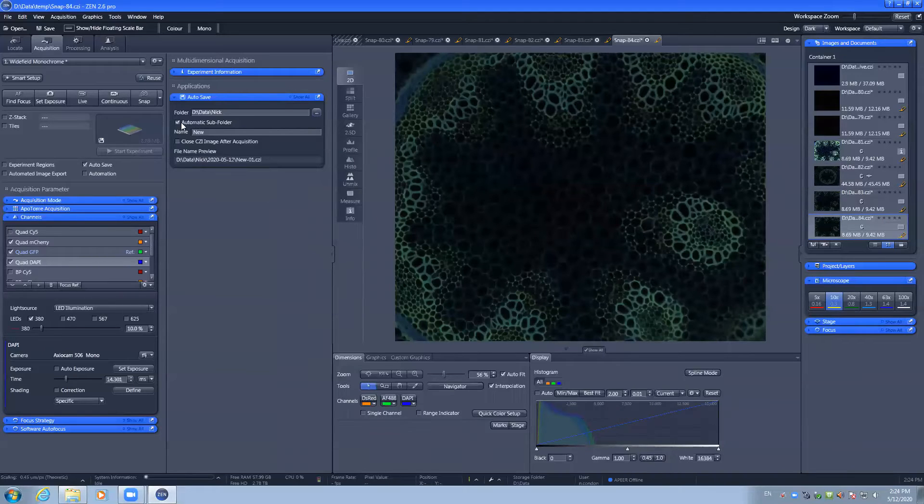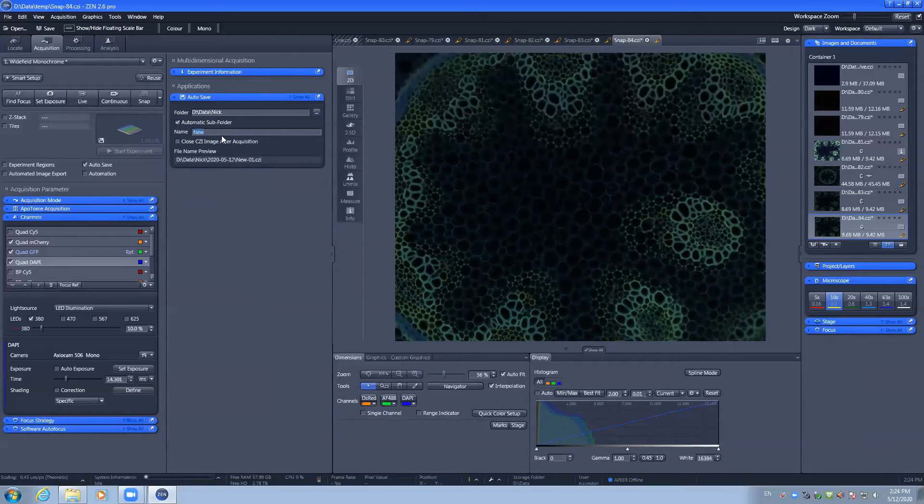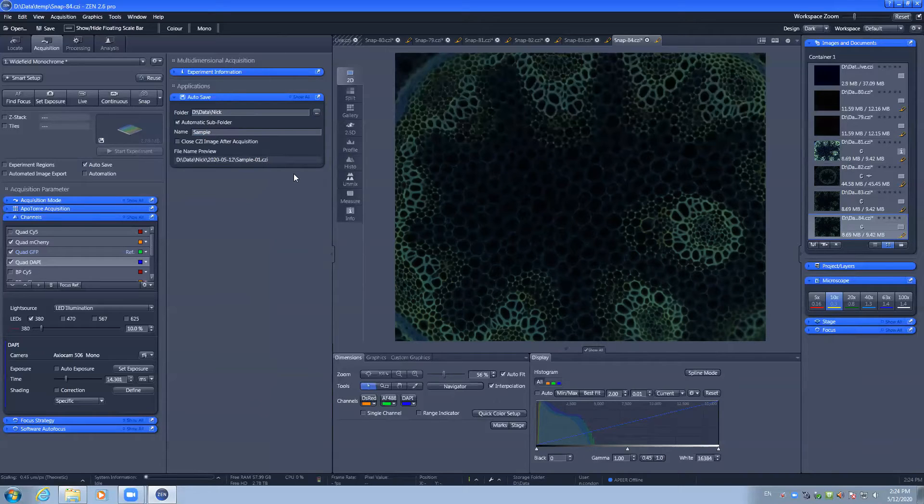It will automatically create a subfolder with today's date if it is ticked. And you can change your file prefix to something relevant to you and your group.